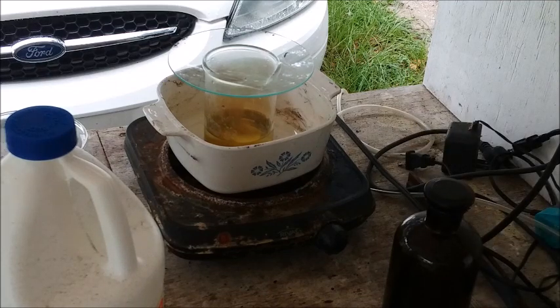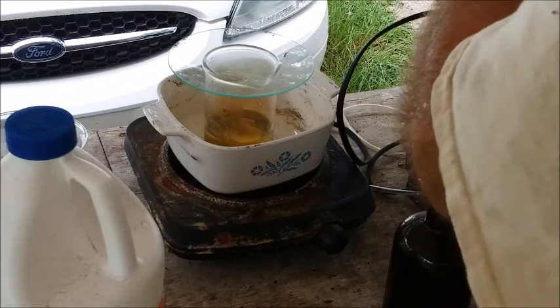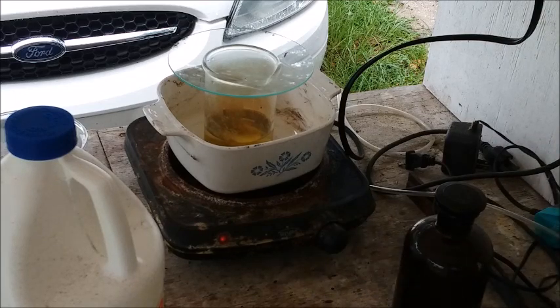I don't want to put a lot of excess nitric acid in there, because then I just have to neutralize it. So let me warm this up a little, because aqua regia works better around 70 C. So we'll get this warmed up and see if we can get all that gold to dissolve. If it won't all dissolve, I'll put a little more nitric acid in, but that might be enough. I'll show you what it looks like as it's cooking.